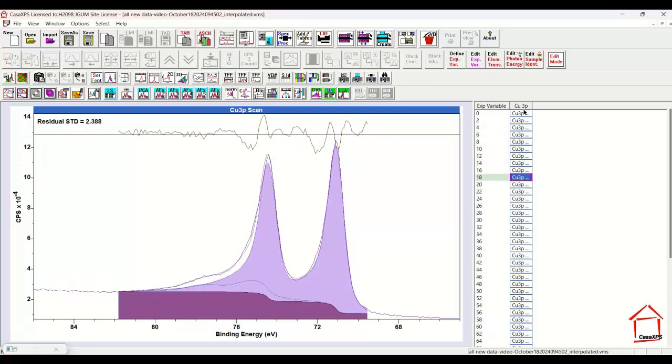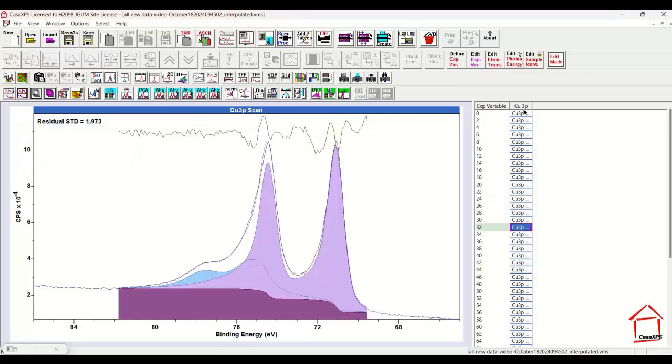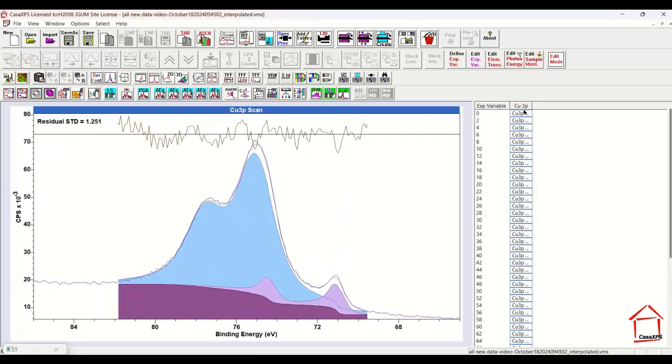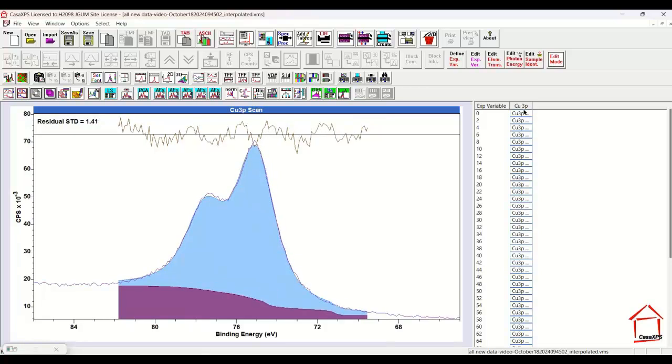We are increasing the proportion of copper, and we can see that in fact the copper and the platinum are available for measurement by this peak model. The peak model is particularly interesting because it's including both the photoemission peaks as components and also components that are representative of Shirley backgrounds that are associated with these photoemission peaks.